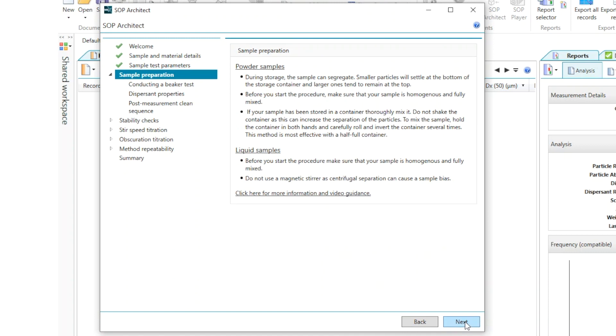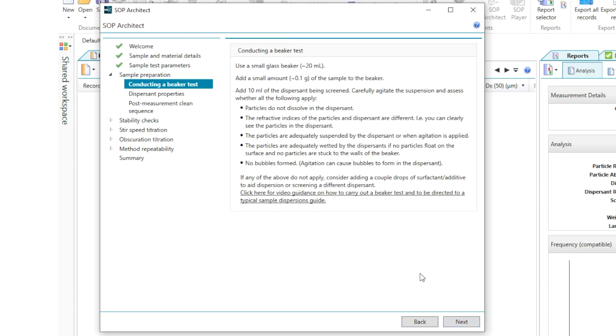Here we have a series of steps to help guide you through the sample preparation process whether that be for a powder or liquid sample. We also have some advice on carrying out beaker tests before the measurement to ensure that your sample is dispersing accordingly.